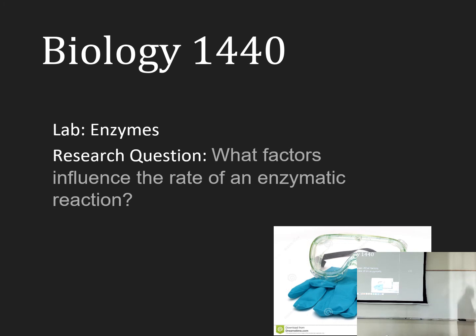All right, now today our lab is going to cover enzymes. We are doing lab number 5, starting on page 33 of the lab manual. We're really going to start on page 34 because page 33 is mostly just questions.